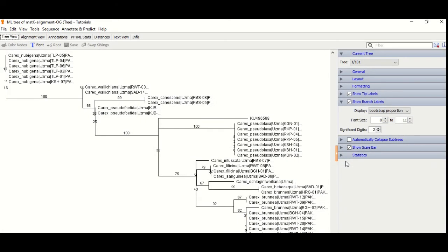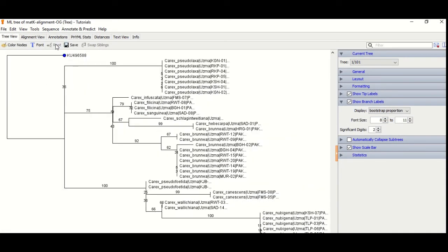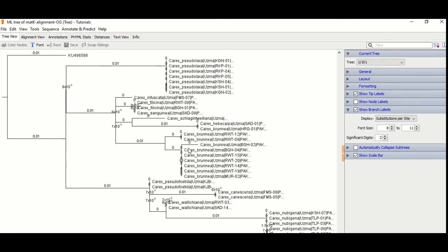When the tree is constructed, we will check it. We will check the branch labels and node labels.